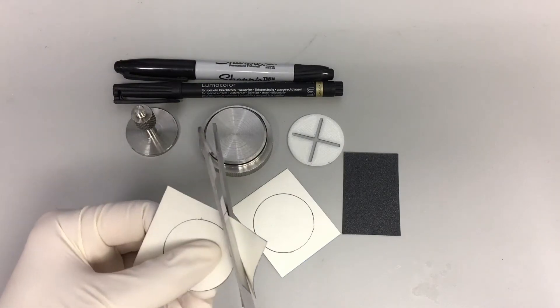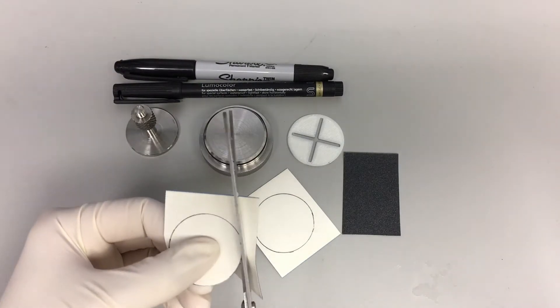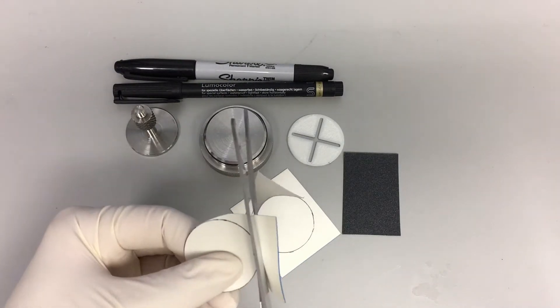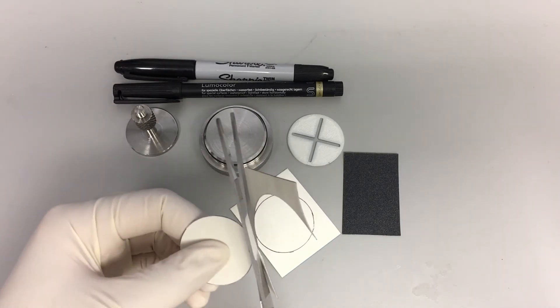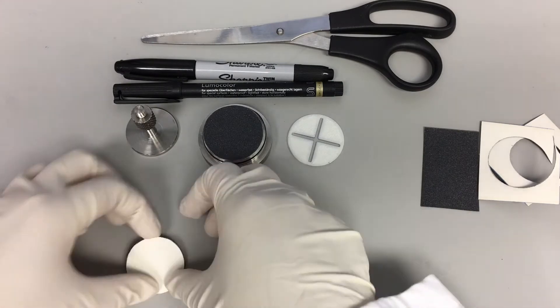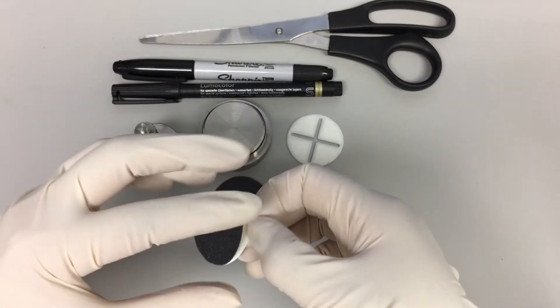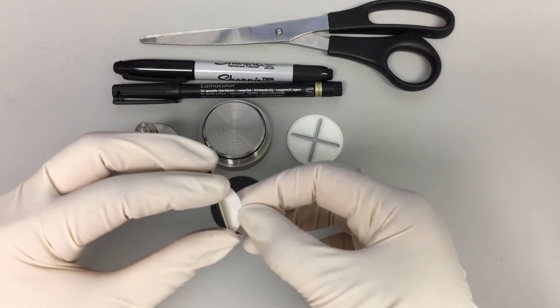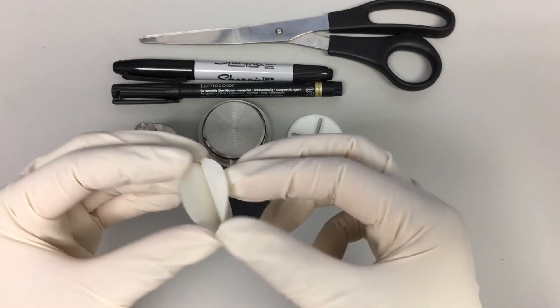Cut two pieces of adhesive sandpaper to cover the entire surface of the indenter and the sample holder. Peel off the protective paper from the back side of the sandpaper to expose the adhesive surface.